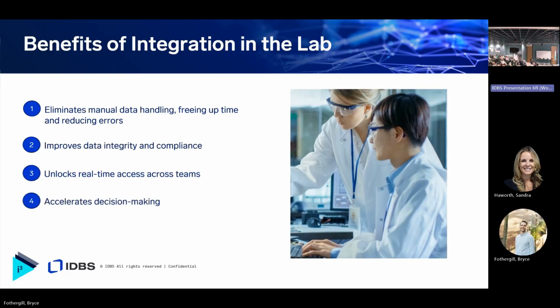And then finally, especially with the integration going into the data backbone and also coming out from the Polar Insight side, all of those things coming together really accelerates your decision making. Without all those pieces, you can't really accelerate any kind of decision making. You don't know what you're looking at step by step. But with everything coming together, you can truly see how you can identify and fine-tune things to make the runs better in the future, and hopefully take some time out of your day to do more important aspects of your job.